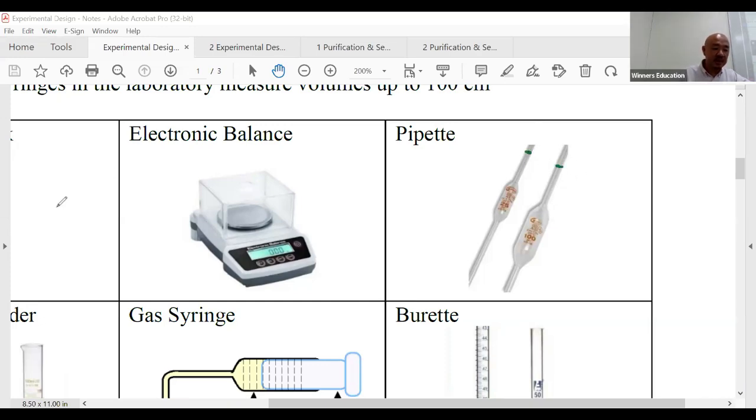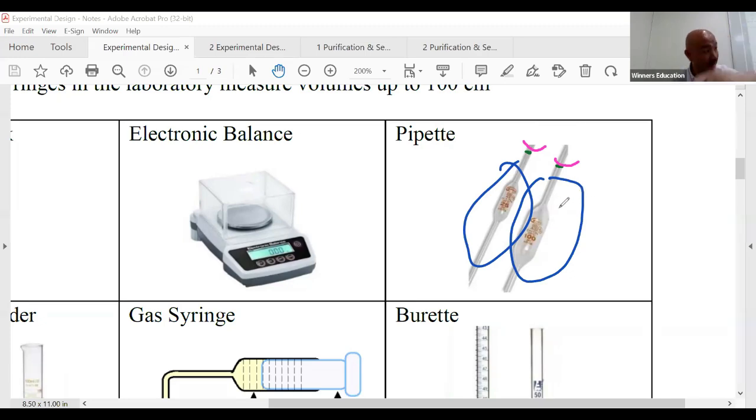And remember, when you fill up a liquid, how do you fill? You fill to its meniscus. Right? Something like that. You observe it. Something along the line, the meniscus. So again, you fill there, and then you have a fixed volume of 25, fixed volume of 100. And it's considered precise in chemistry because of how it's made. It's not cheap. Okay? Done. Same as the burette.